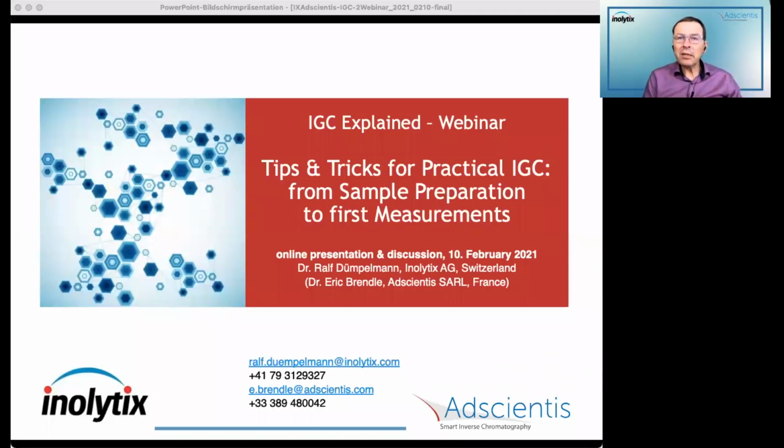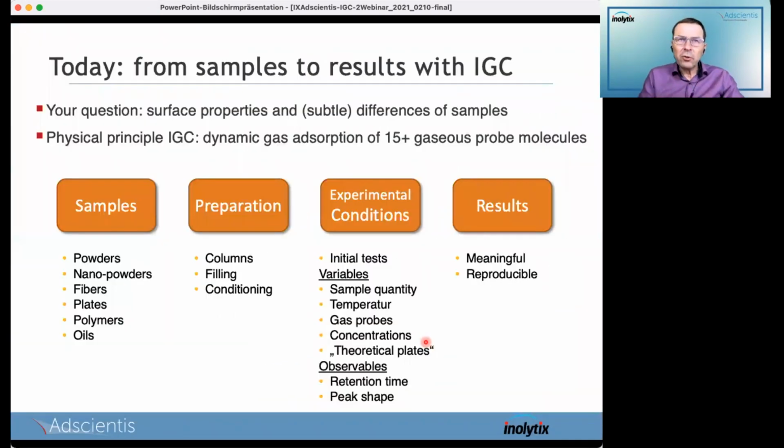We really want to include a lot of practical things to this. Not much theory, but a lot of practical terms. So we hope very much that you can enjoy it and you can take profit, the newcomers as well as the experts. Now, today, we really focus from samples to first results with IGC.